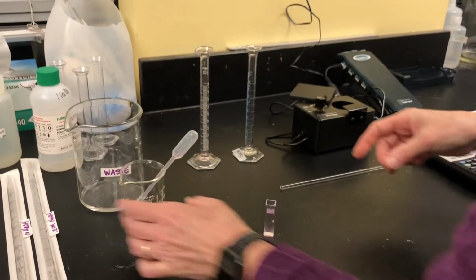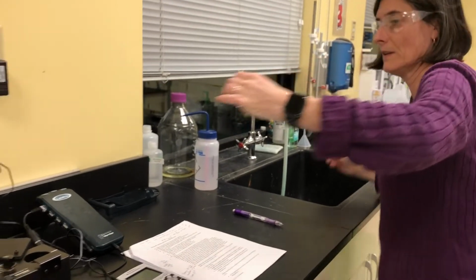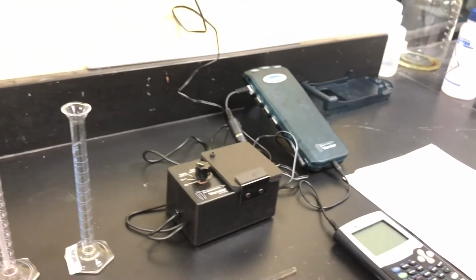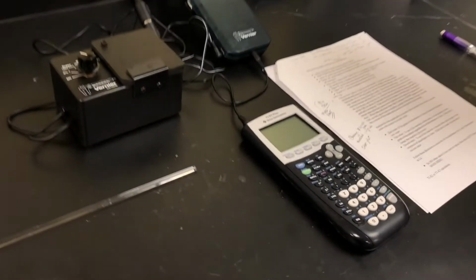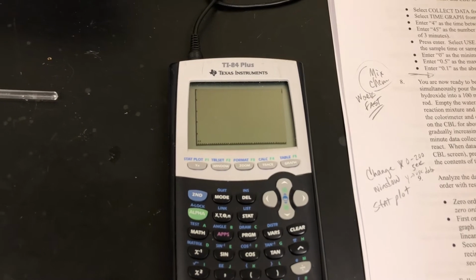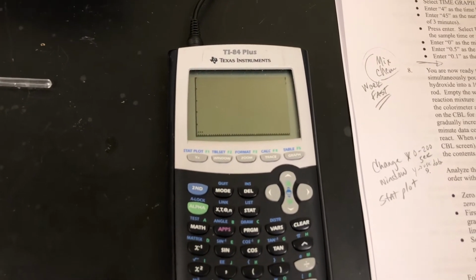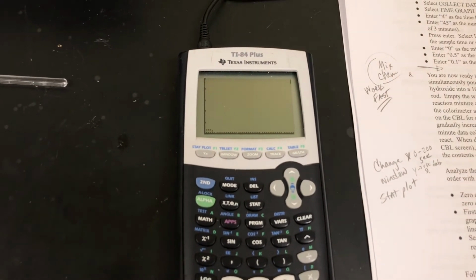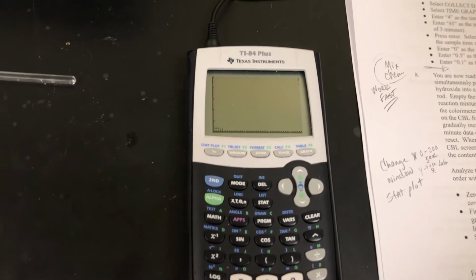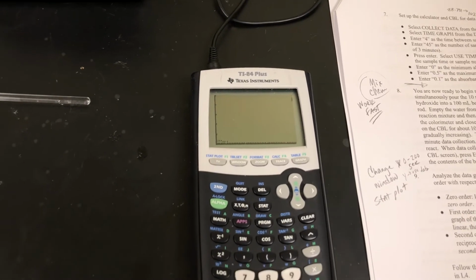That looks good. And I think I actually touched the clear parts. So I'm going to very quickly wipe it down just to make sure that there's no fingerprints. Close it up and hit enter. And then now I can start my data collection. And you'll see that what the TI calculators do as they're doing the data collection is they just kind of give you a graph, and you can see little dots in the bottom left as it's sampling. And again, it's sampling at every 4 seconds. So we won't really see a tremendous amount of information until after the experiment is over, after 3 minutes.